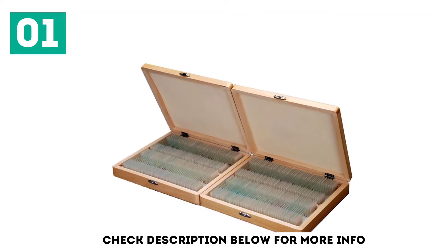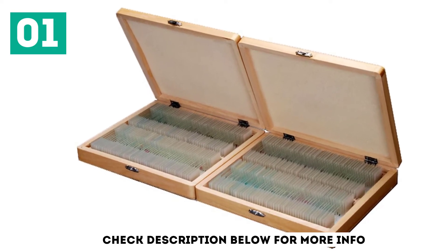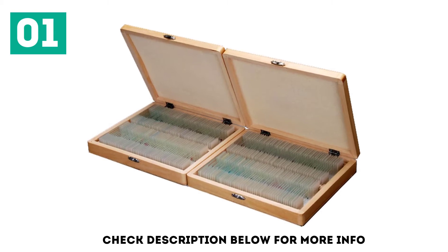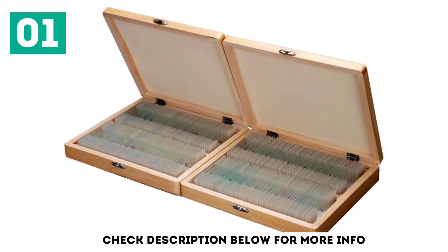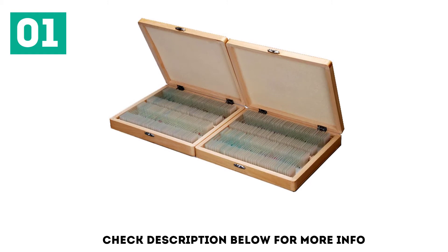The M-Scope PS200 Basic Biology Prepared Slide Set includes plants, insects, and animal tissues, for use in biological education. It comes with a set of 200 prepared slides with a protective wooden storage box for safe and easy organization. It is great for basic learning of biological science, and also makes a great gift for those who love exploring biology.